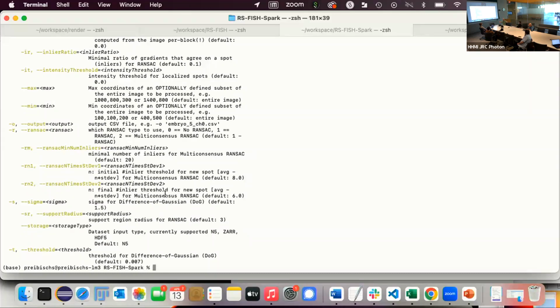it doesn't actually open the image. It only loads the data when you actually access it. So when you make this block, it will load all surrounding blocks to be able to do the border. If you do one block, it actually opens 9 blocks. That's what it needs to do, right? Because otherwise the data is not there. That's why it knows exactly whether the point is here or here, and the respective block will keep it only if it's here or here. So it's really identical to running it without blocks.